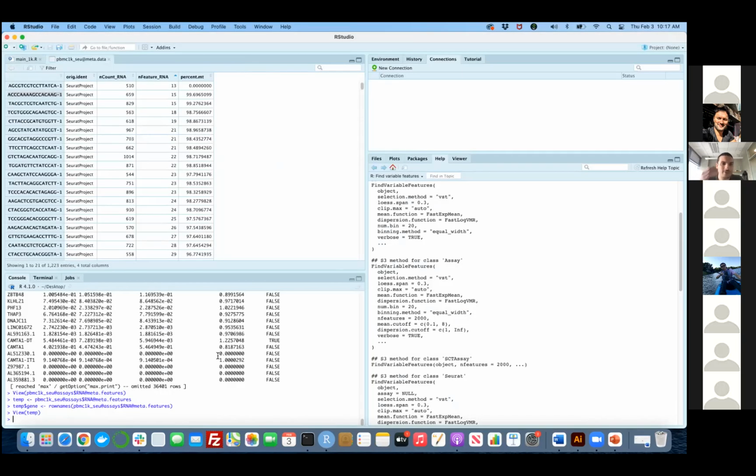There are different kinds of tables where the gene column is there or not. So you can manipulate the data a little bit as I've been doing really fast, and just take a look at the table really quickly. Let me just share this with you as well. That's why R is really good. It's not just a 100% interactive package. You can just manipulate the data a little bit to get more out of your tables.